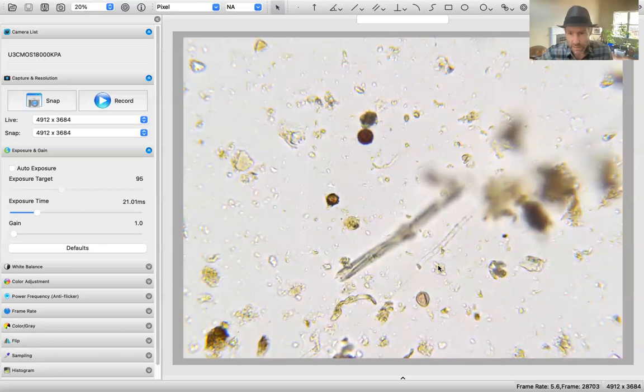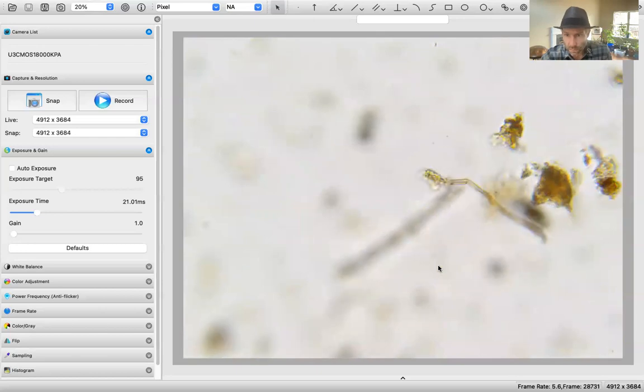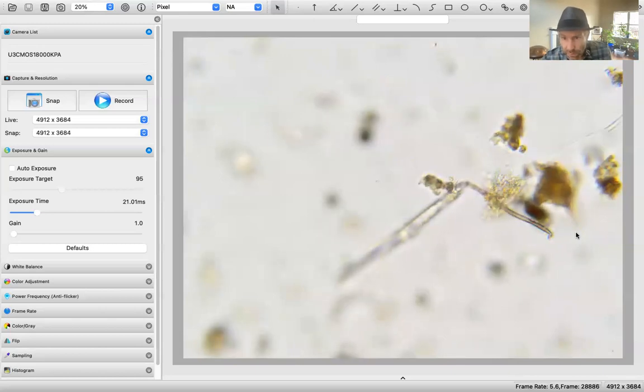So we're going to go back to that other fungi, back to the top here. And there's some actino right here too. So right there is actino. And that looks like, I want to say a 2, maybe no, it's a 1. So we're going to call that 0.1 actino. And now for that fungi, let me look at that end. Make sure that's uniform. Yep, it is. And yes, that is a brittle break at the end.